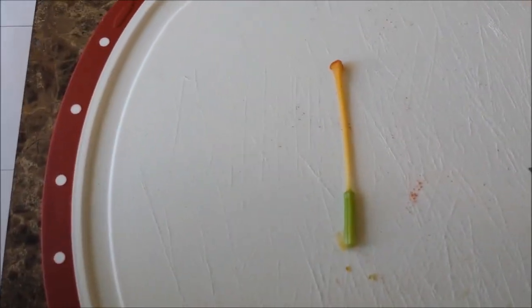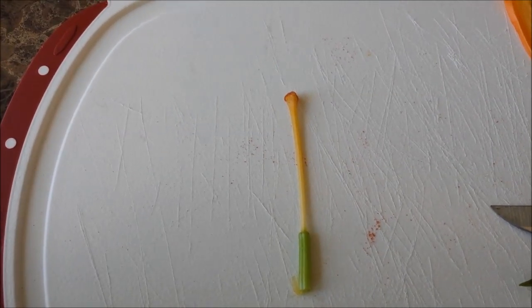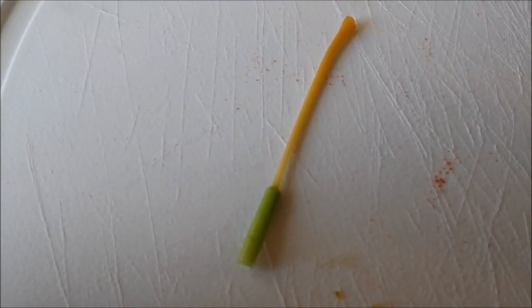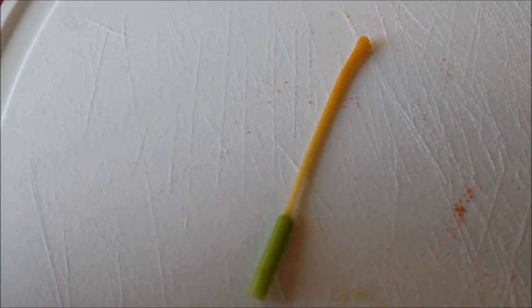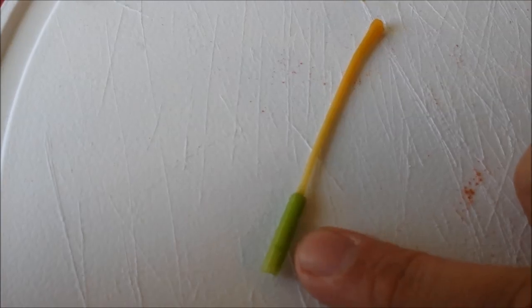Next we will be removing the stigma, which accepts the pollen from a bee or some other kind of pollinator when they bring it to the flower. So we removed the stigma from the top. Next we will be removing the style, which is right down the center here. And then that will leave us with the ovary of the flower.